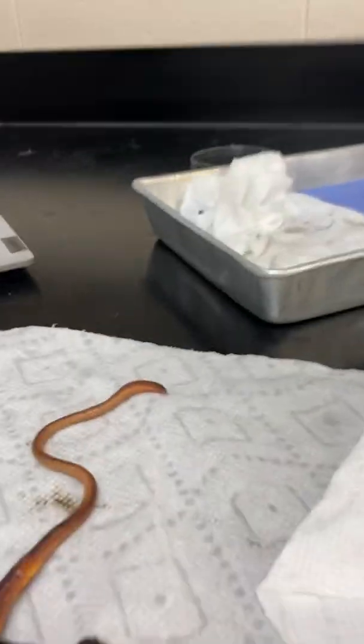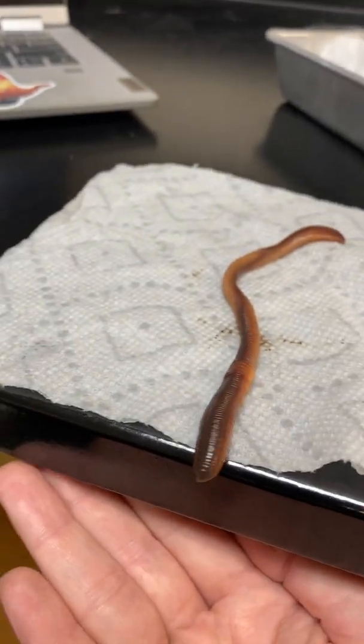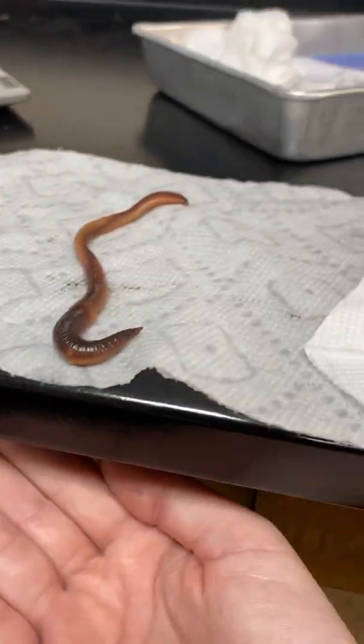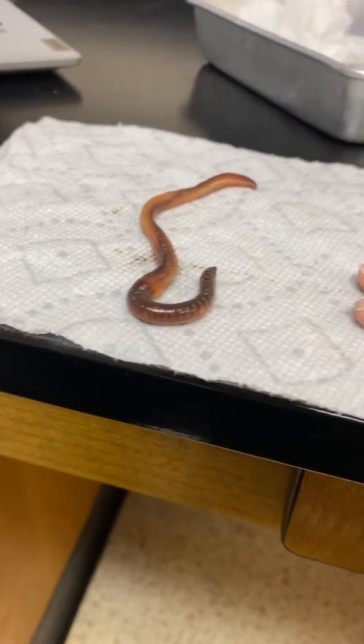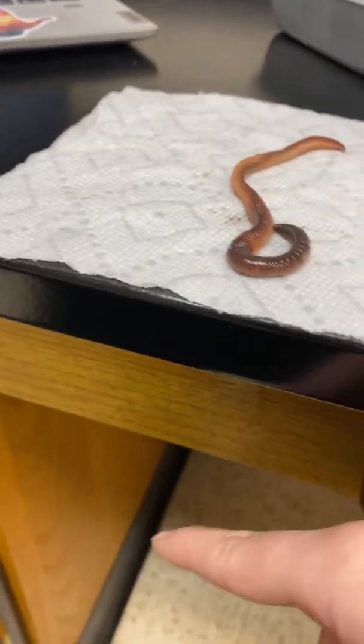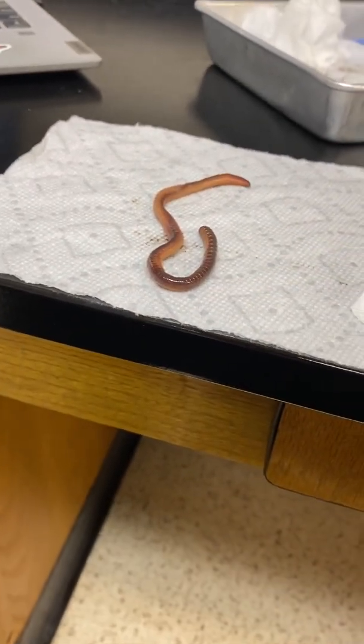So it's using its posterior tail end to kind of go backwards and pull itself back up. See? The paper towel allowed it to grip a lot better, the setae. So in response to gravity, hanging off the edge, it pulled itself back up on the table instead of going towards the floor.